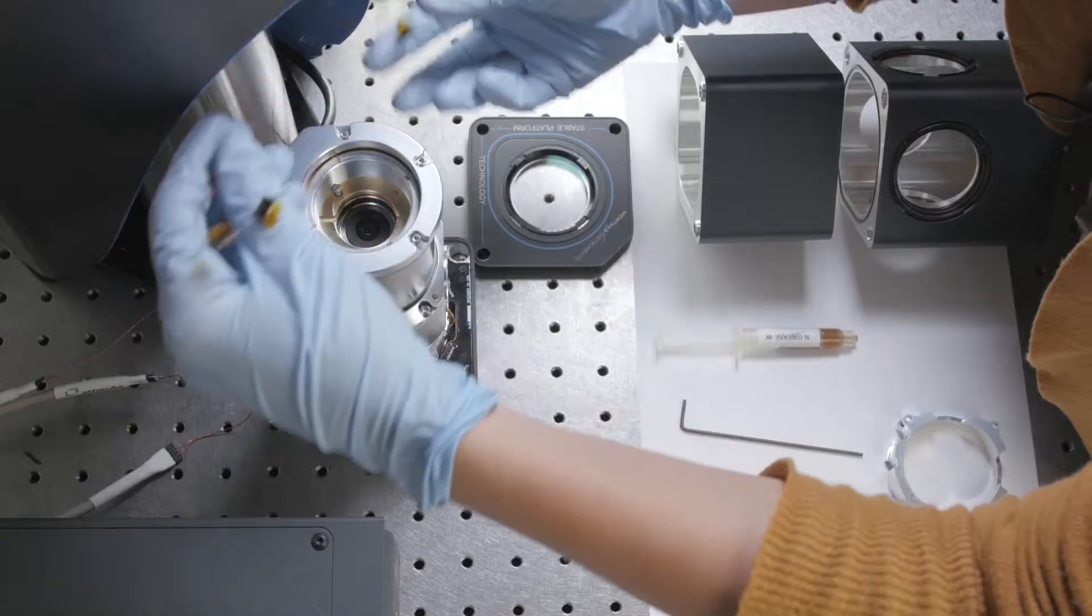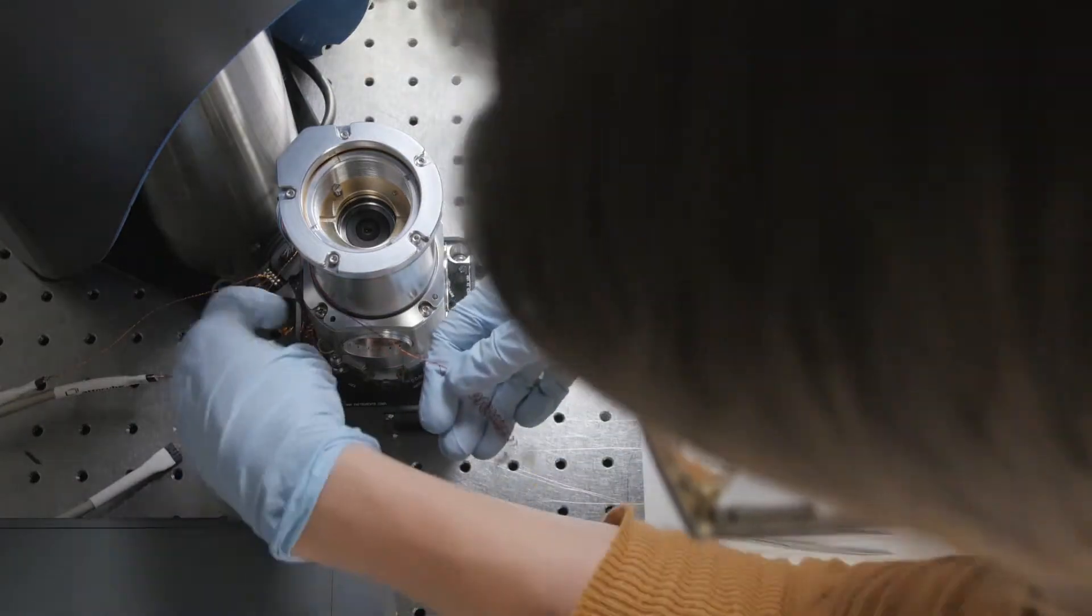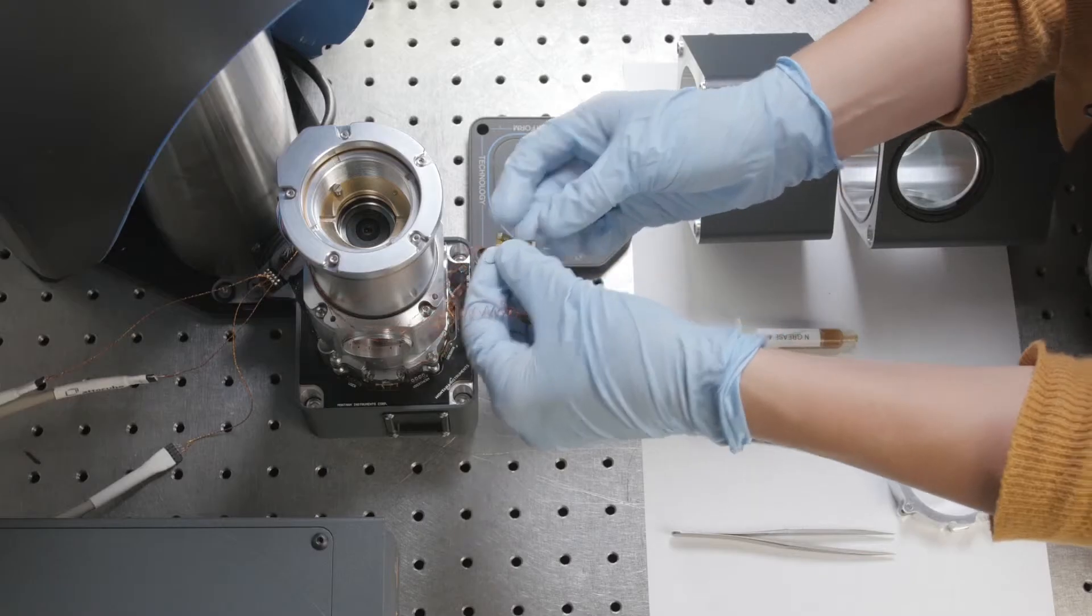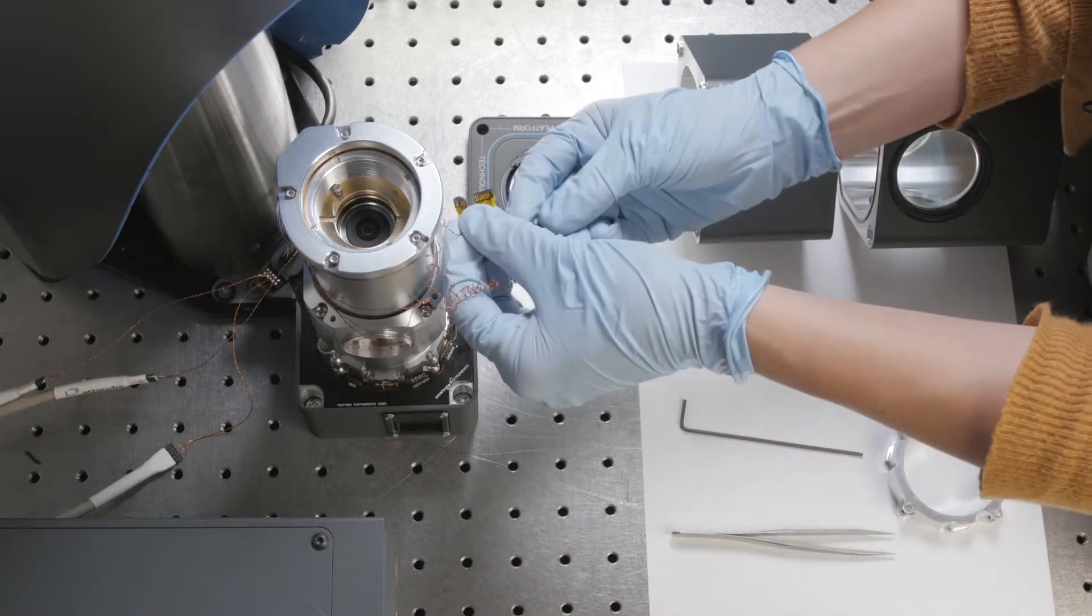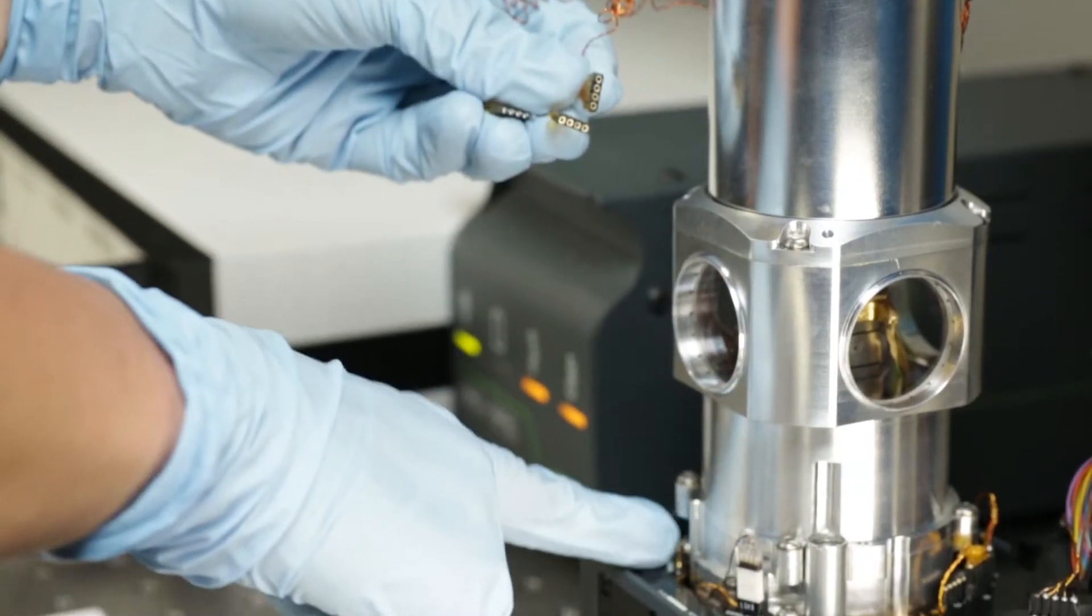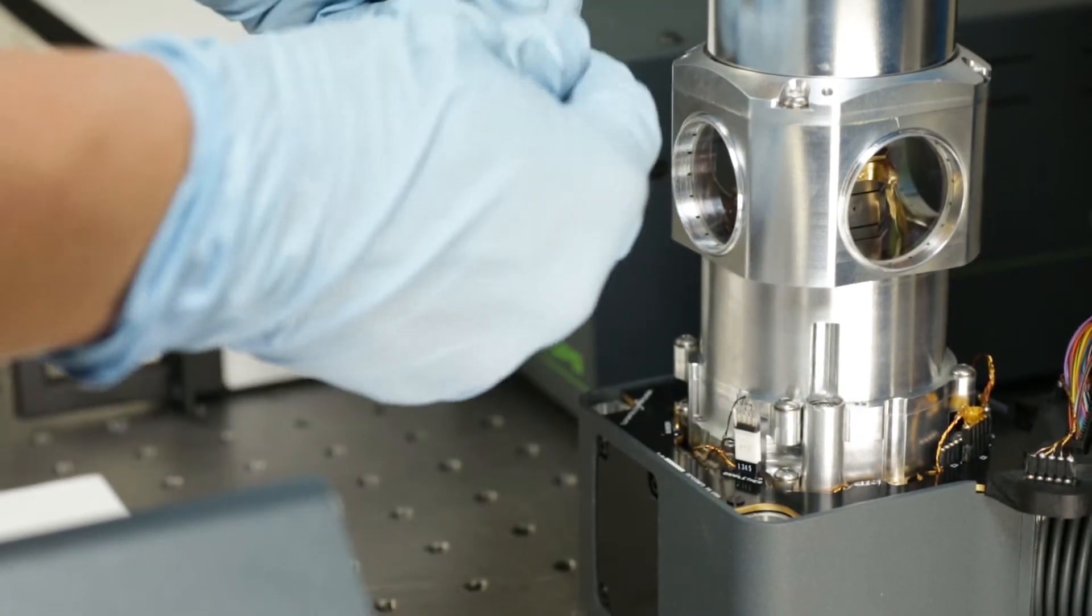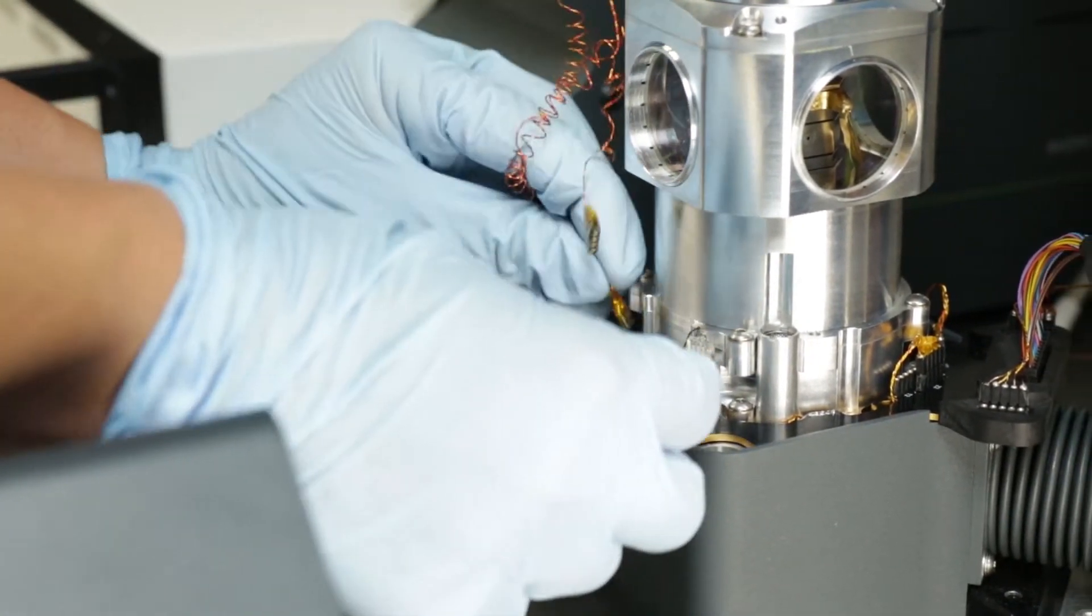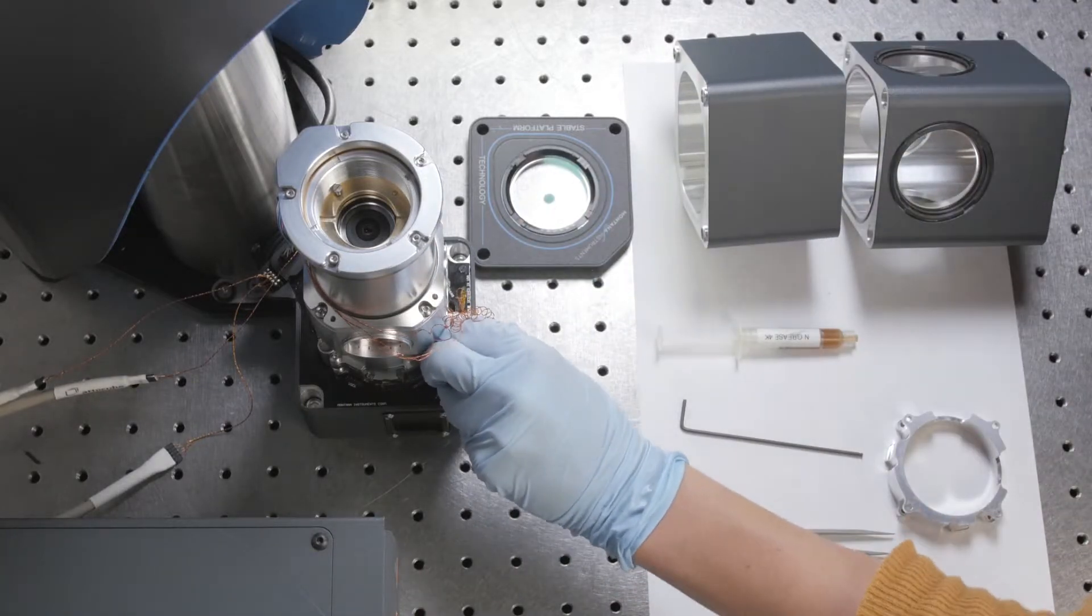Then we'll plug in our wires. They're labeled user heater and user thermometer, and those will be plugged into the corresponding connectors on the circuit board. Plug in the user heater to the user heater connection, and make sure the labels are pointing out.